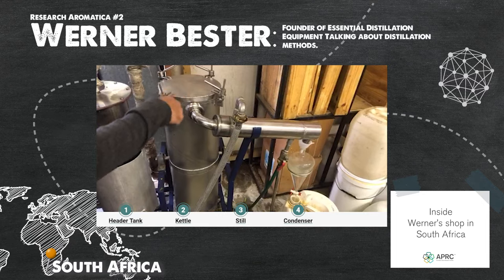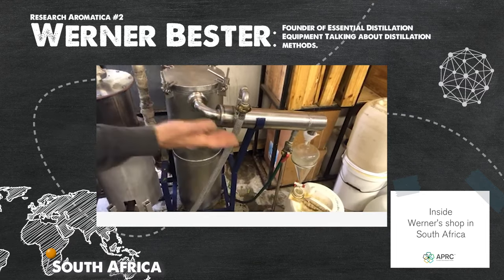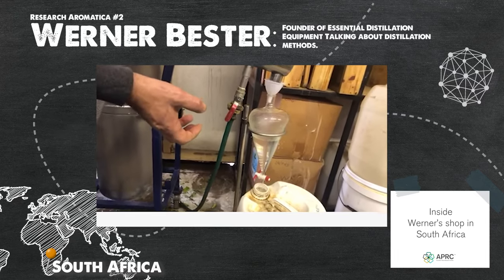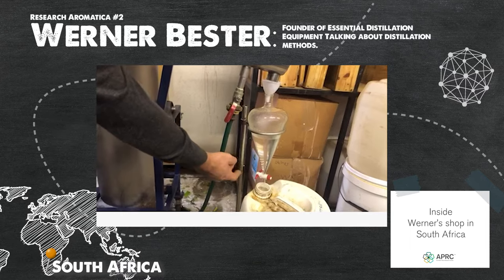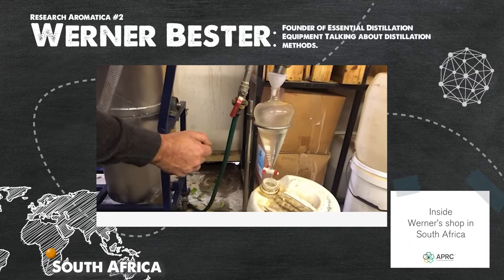The vapor and the steam from the condenser then gets cooled down to water and oil, usually, where it comes out. In this case, it's not a continuous type of separator. This is more a lab scale kind of separator. And here you would have either your oil sitting at the bottom if it's heavier than water, or it will be floating at the top if it's lighter than water.